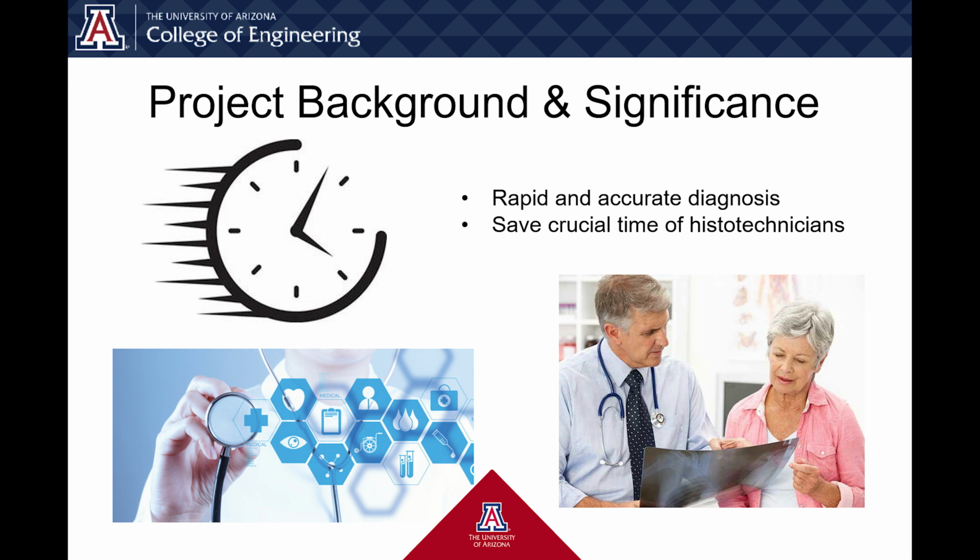In the intricate world of medical diagnostics, every second counts. At the heart of pathology labs across the globe, histopathology tissue blocks play a crucial role in diagnosing diseases, most notably cancer. These small blocks, which contain tissue samples from biopsies, are the key to unlocking vital information about a patient's health. But the process of sorting and orienting these blocks is painstaking and time-consuming.